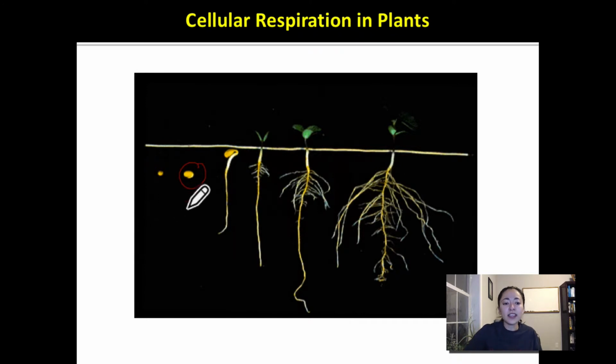And the best thing about using a germinating seed is that it can't photosynthesize. So we don't have to worry about photosynthesis interrupting our measurements of gas exchange that we will be seeing.